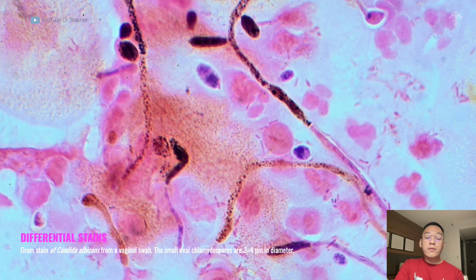Another photo of a differential stain, a gram stain, the same thing as with the previous slide. This is Candida albicans from a vaginal swab. The patient is experiencing candidiasis, and the medical technician was able to isolate these small oval chlamydospores that are 2 to 4 micrometers in diameter. These are fungal cells, and all fungal cells will show a gram-positive result using the gram staining method.